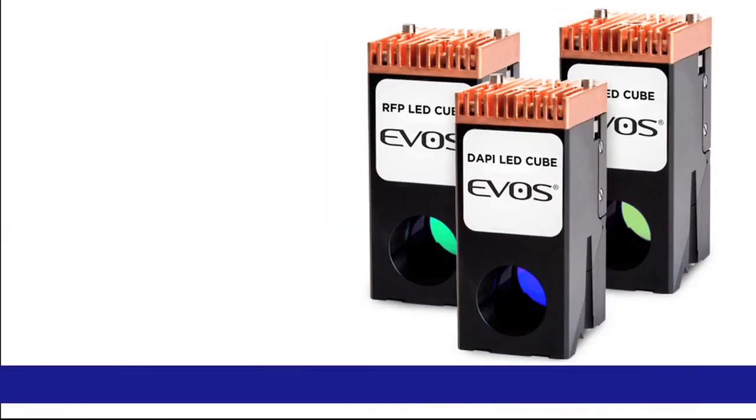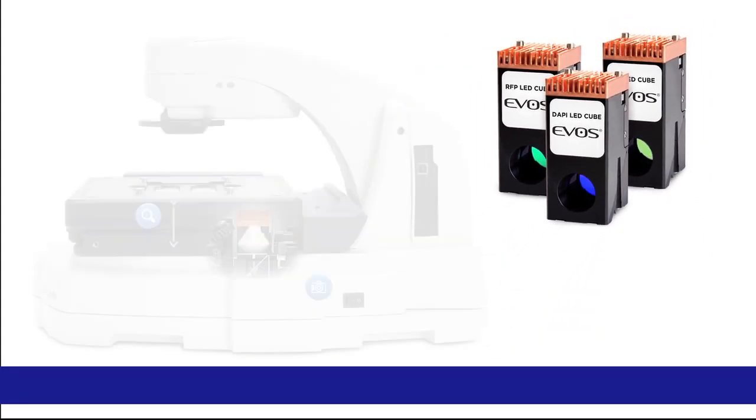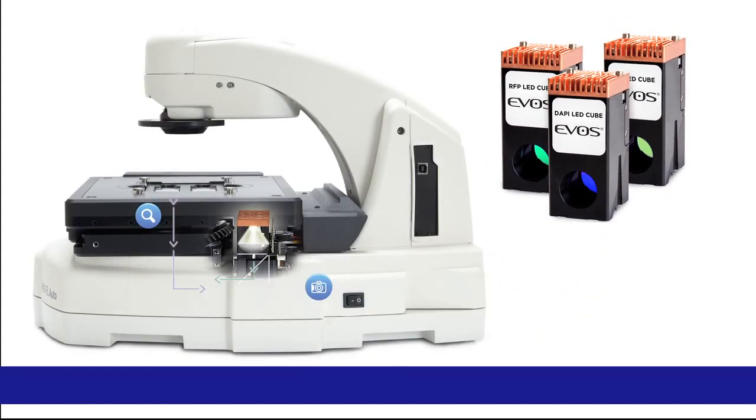The EVOS FL Auto is powered by the revolutionary EVOS LED light cubes. EVOS light cubes integrate LEDs and high-performance filters in a novel illumination system that delivers precise control, minimal maintenance, and exceptional reliability.